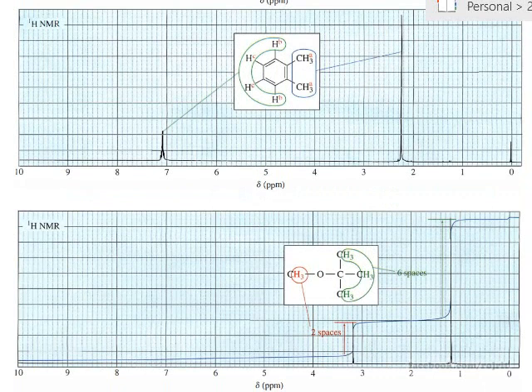Not only the position, you can gather information from the NMR data, but also the number of hydrogen atoms as well. In this picture, as you can see, the blue color is the integration.